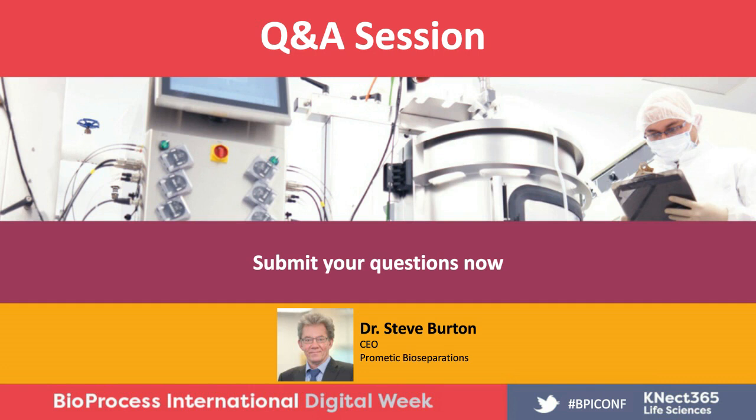Yes, we do. I mean, we don't publicize these at the beginning. But if any users of the plate have identified a ligand that they're particularly interested in and they want to know more about it, we'd be very happy to share the structure of that ligand with you. That will probably require some kind of confidentiality agreement, depending on the type of information you're interested in. But certainly we can provide information on the ligand structures, if you're interested in any specific ligand and you wish to take that forward in your process development work.